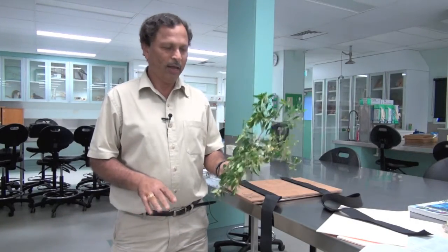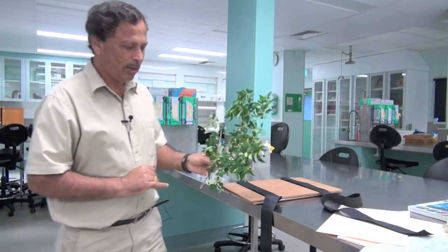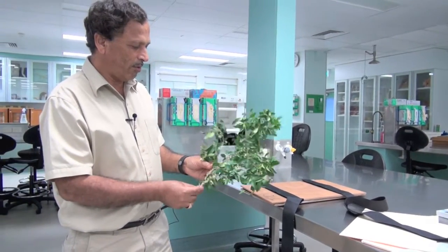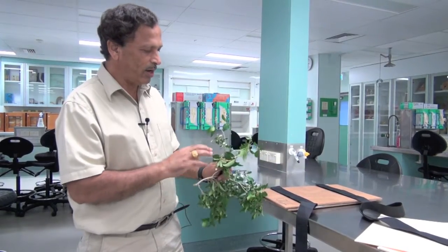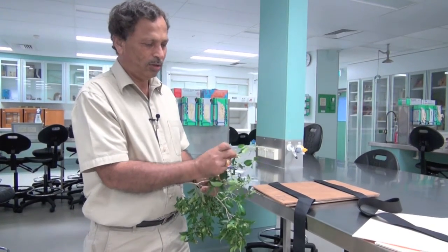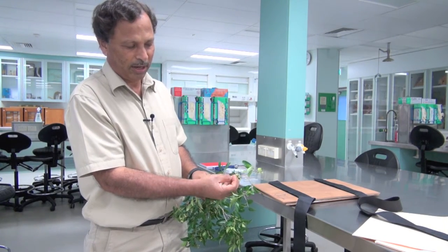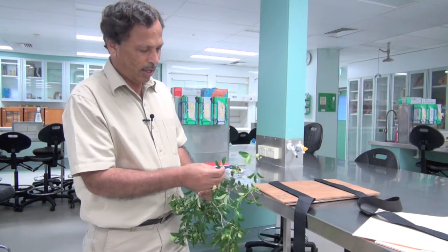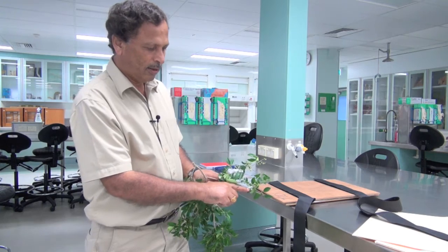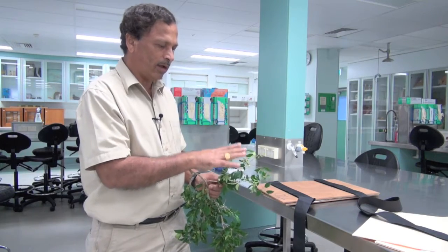We have been to the field and collected this sample. When you collect the sample, make sure that the flowers in that branch have a variety of stages or different types of flowers. You can see that some flowers are still immature — they're in their buds — some have already dropped the petals, and some are just blooming. So you need to have a variety of flowers in the branch you collect.